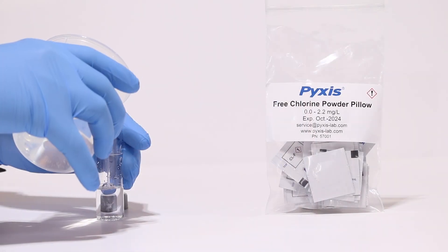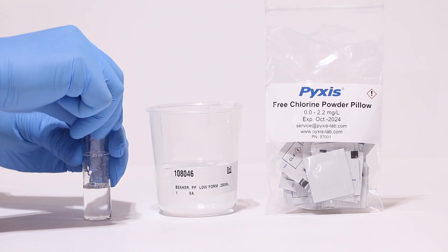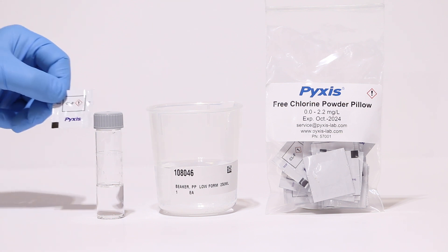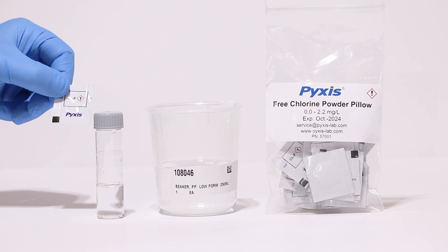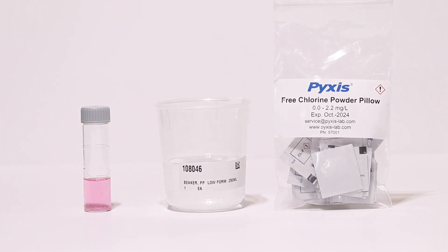Then fill your provided sample vial with 10 milliliters of sample and add one powder pillow of DPD free chlorine reagent. Cap the vial and swirl to mix. If free chlorine is present, a pink coloration will develop during the reaction process.